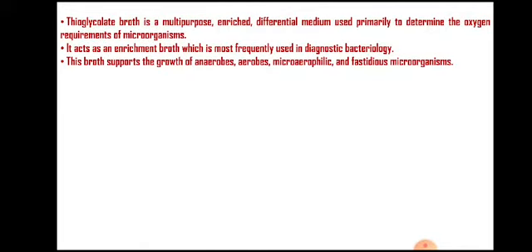For this, we make use of several media, so that we can assess whether the fermentation product or the formulation is free from microorganisms such as bacteria and fungi, particularly aerobic and anaerobic microorganisms.